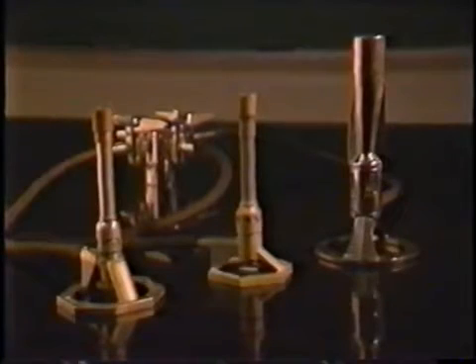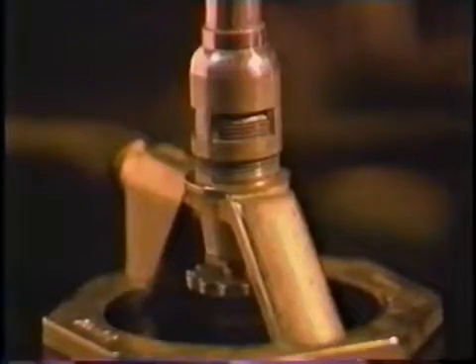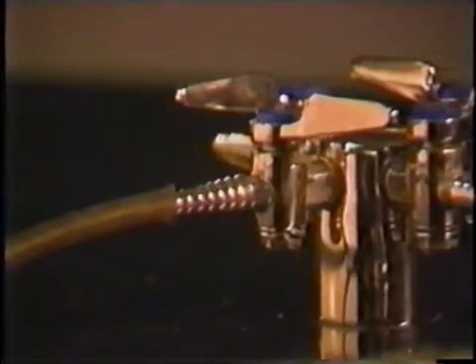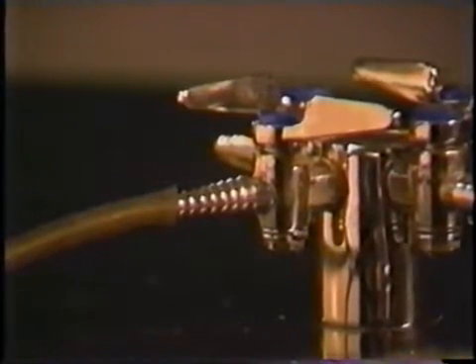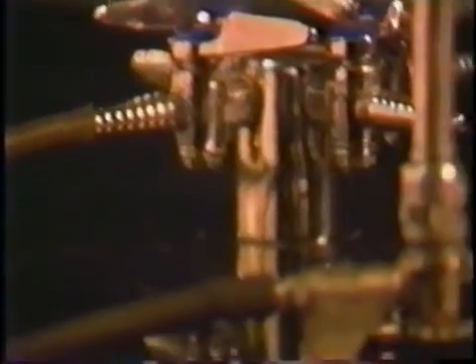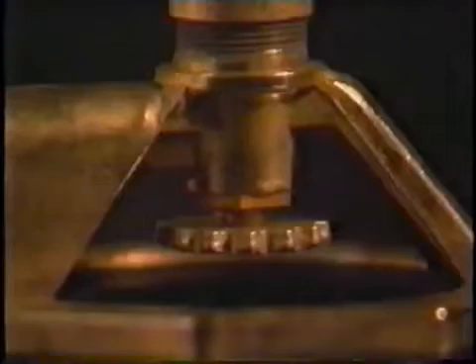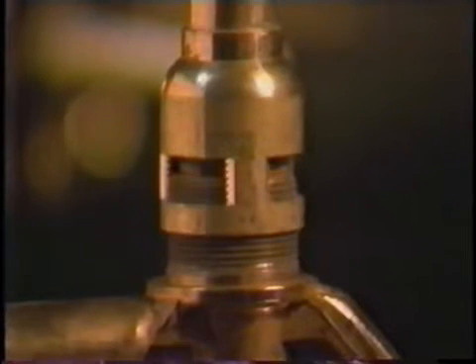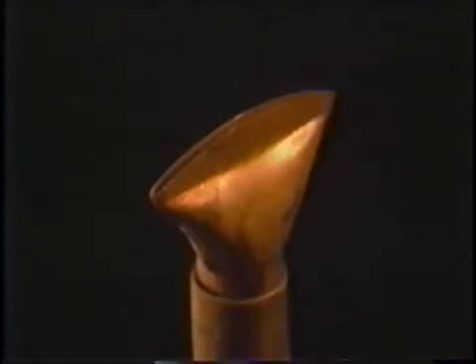There are several types of Bunsen burners, but they all have the same basic parts. The gas comes from an outlet on the lab bench. A rubber hose fits over the tip and over a similar fitting on the Bunsen burner. Most burners have a valve at the bottom to control the flow of gas. Air inlets control the amount of oxygen in the flame. A wing top can be placed on the burner to spread the flame out.